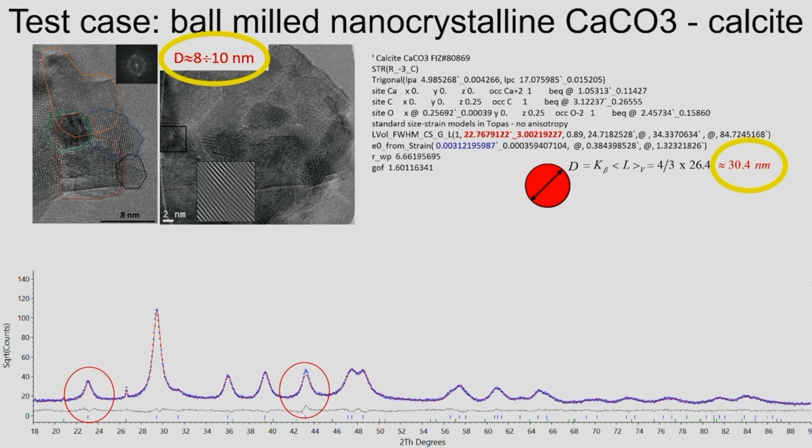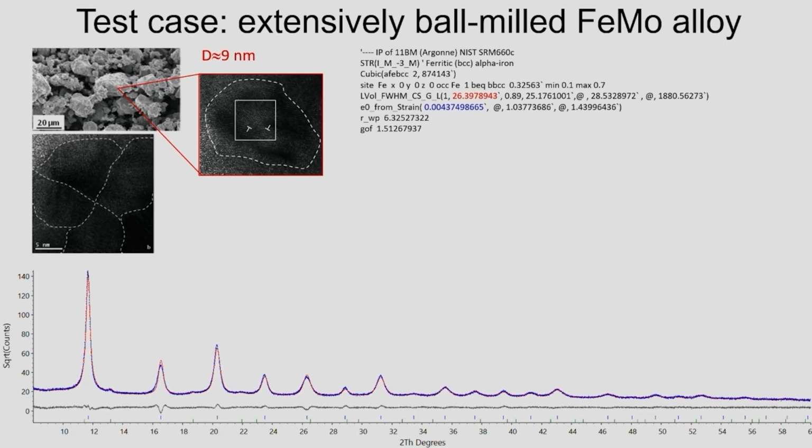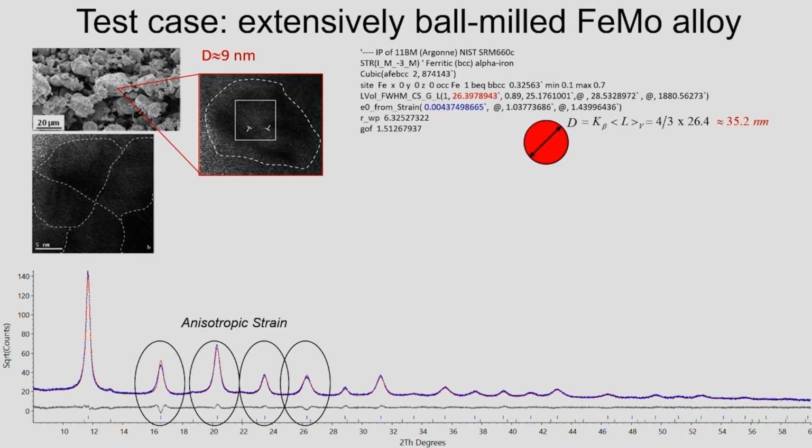One more case now, a metal, and these are data similar to those you find in the folder you can download. Now we know that this is going to be full of dislocations after grinding. It's been heavily plastically deformed. And this is how TOPAS behaves. Now, we clearly see it doesn't behave very well, because this is an iron alloy. Iron is highly anisotropic.